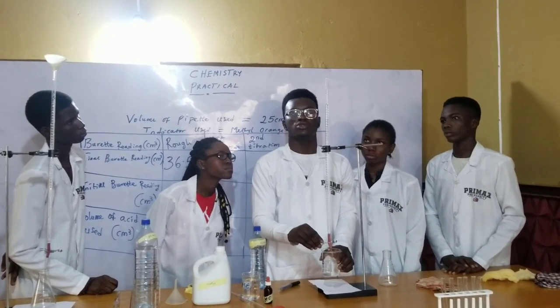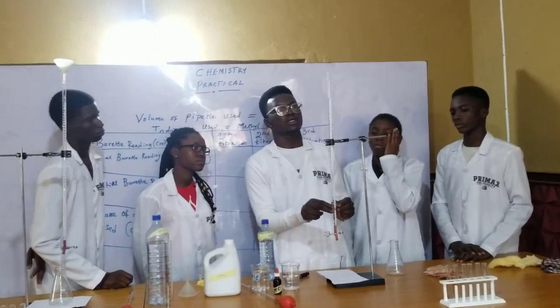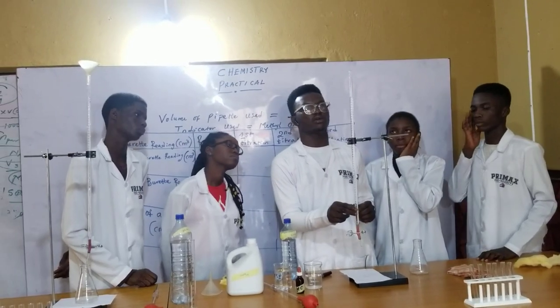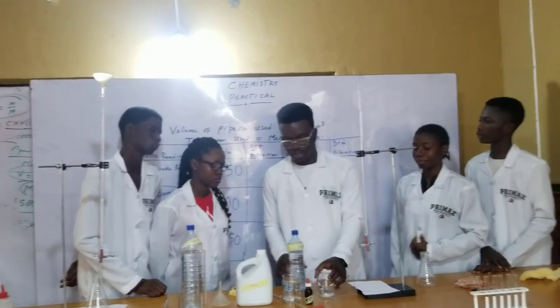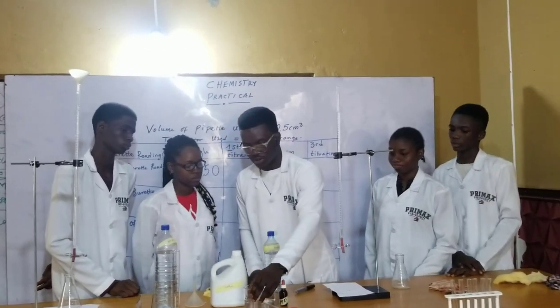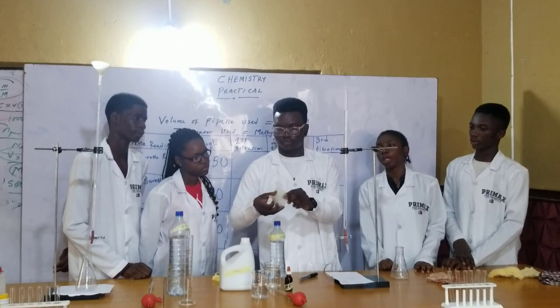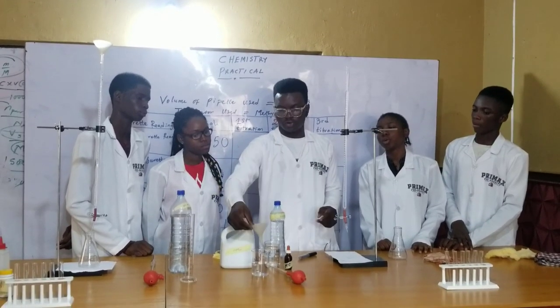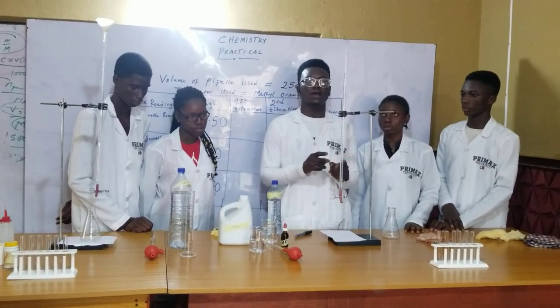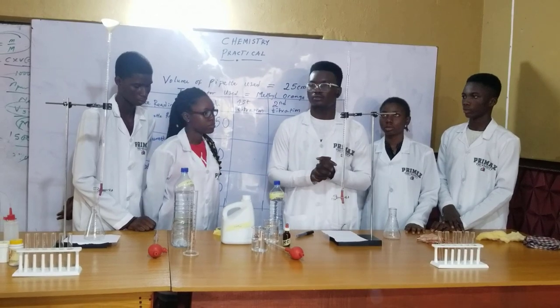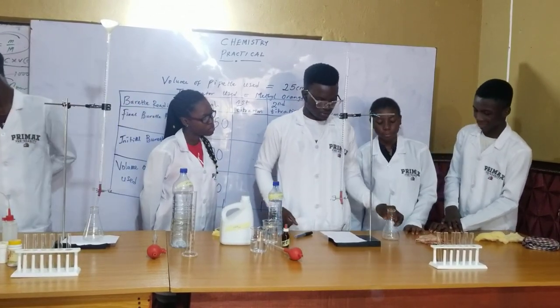That's why you always do the rough first — so that even if there's any error, you can get rid of it. Now we want to start our proper titration. Don't forget to always remove the funnel from the burette — that is another precaution you have to take note of.